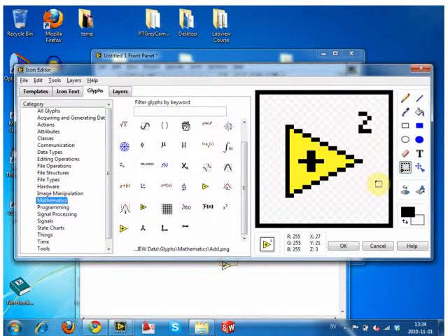How you remove everything: because it's exactly the same as Microsoft Paint, I'll show you on the big screen. There's basically draw a line, draw a point, you have an ink drop and a fill. This one is a selector tool. So you take your selector tool and just draw over the top. Just draw a selection and then hit delete.